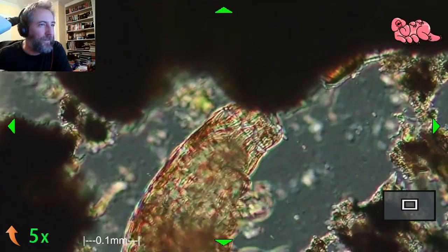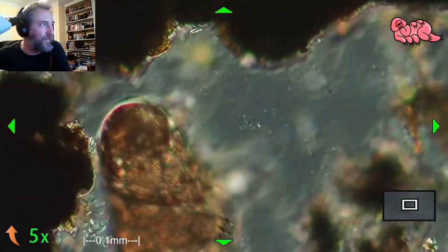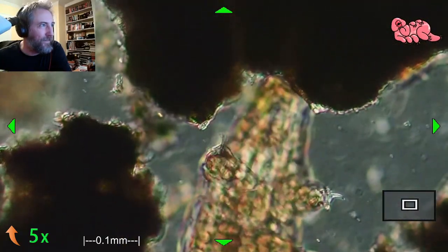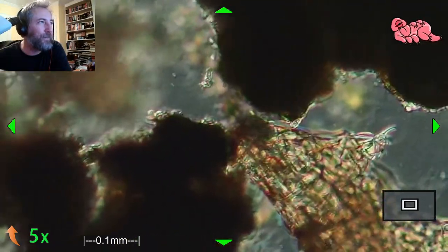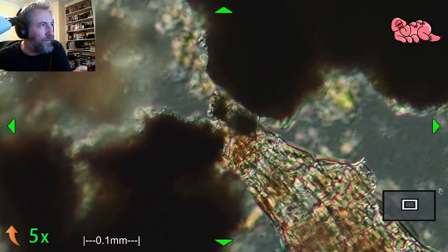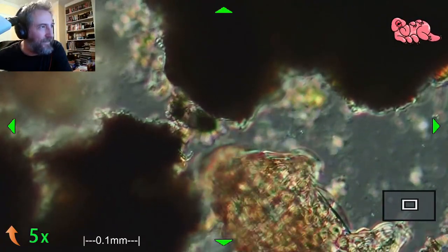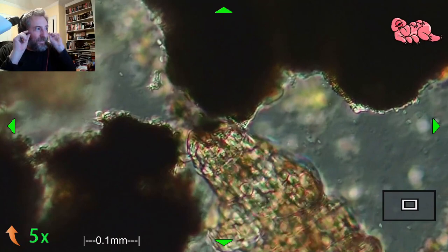Are water bears insects? No. They're not insects because they have eight legs, so that's a good clue that they're not an insect. And insects also have to have three body parts. Oh, this one's got the little eye stalks. You see those little whisker-like things coming off of the head? They're only in focus for a couple of seconds because she's crawling. Let's see if I can get them to come back in. Right there, you can see she's got little eye stalks sticking out. She's got eyes. She's a big girl, and just jutting out from the head on both sides are these little tiny stalks.